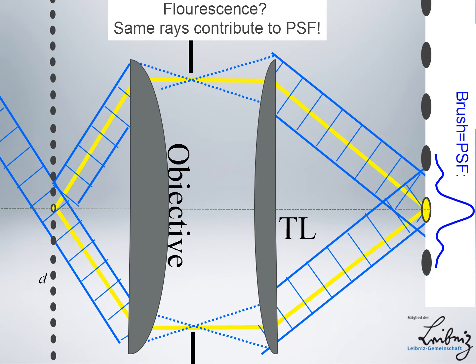And because of the convolution theorem, the point spread function can be decomposed into sine waves and is easily describable by its Fourier transform, which is the optical transfer function. The finest frequency component in the point spread function means that this is the highest frequency in Fourier space which is still non-zero for the optical transfer function. So to understand this a little bit better, I will now go a little bit into Fourier space.